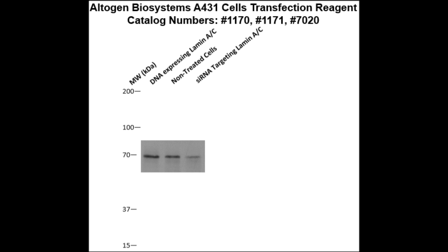Here is a Western blot validation of our transfection reagents. A431 cells were transfected with either lamin A/C DNA, which resulted in overexpression as compared to non-treated cells, or lamin A/C siRNA, which resulted in partial silencing.